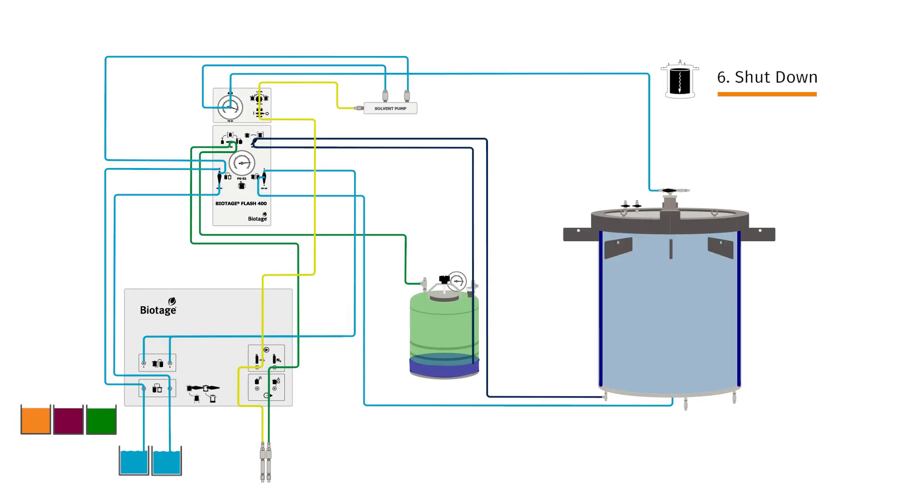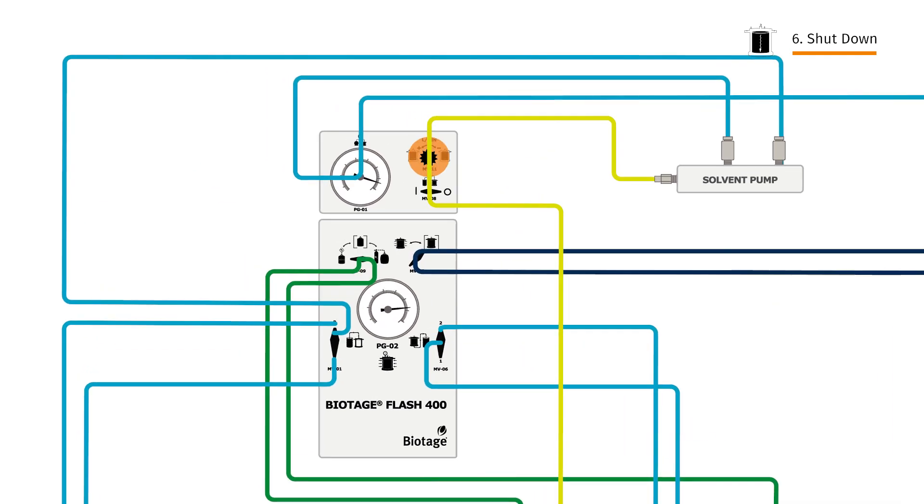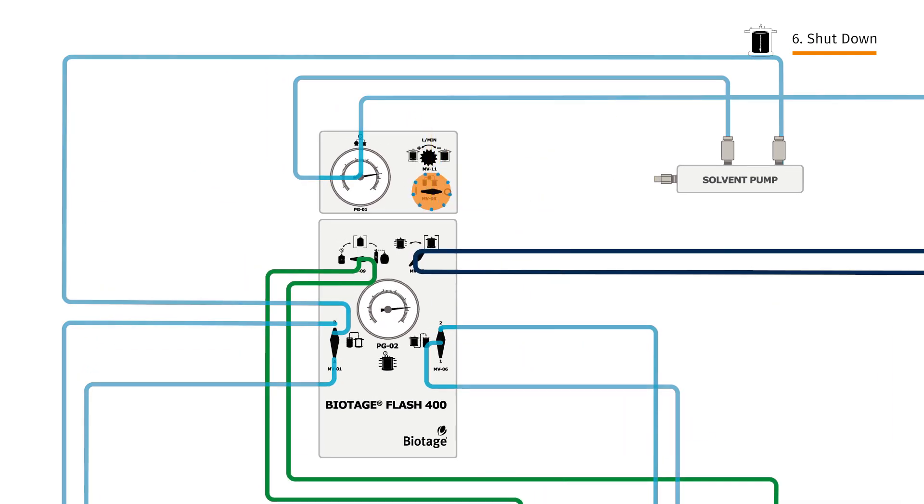When we're done and all fractions have eluted, close the flow rate dial and stop the pump.